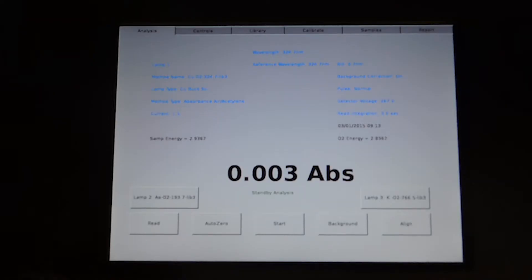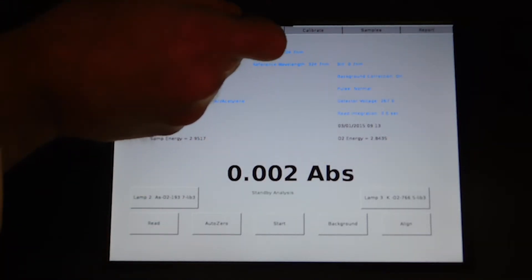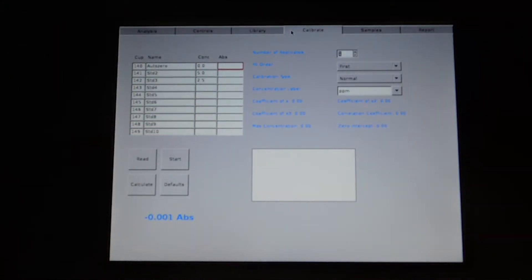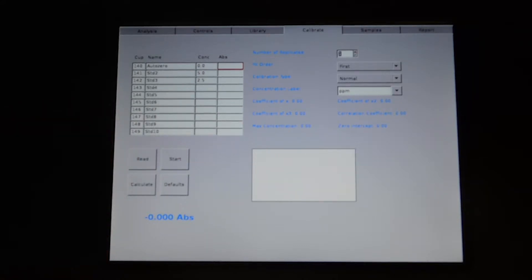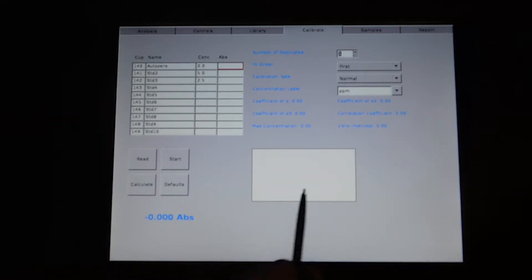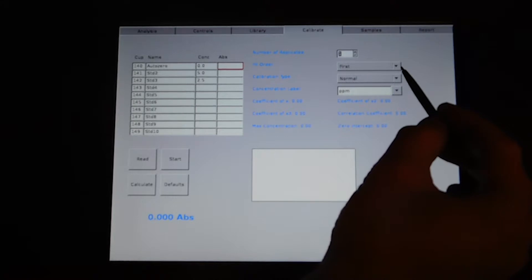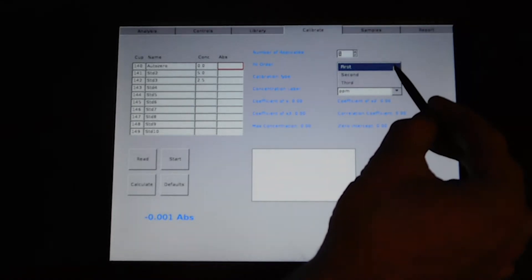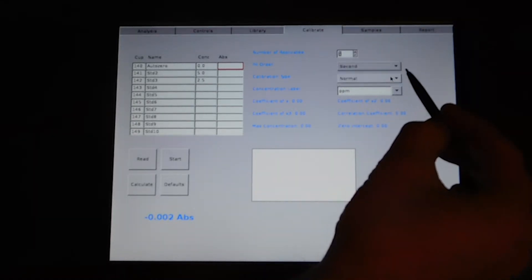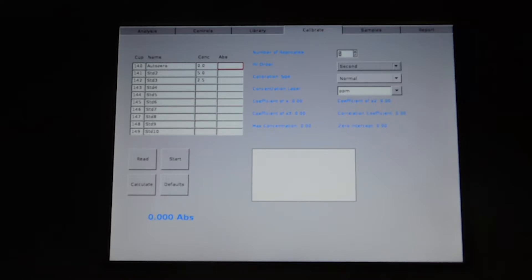To calibrate your instrument, go into the calibration tab. Enter in your values of concentration and the type of curve that you'll be performing. We're going to do a second order calibration. Our two standards are five ppm and two and a half ppm.